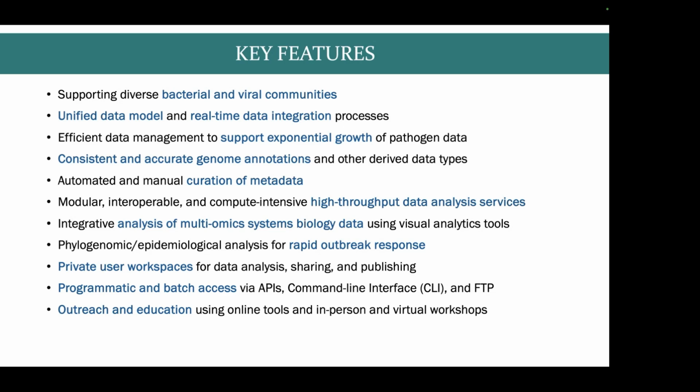So if you're looking at one bacteria or one virus, you should see the same format across the website. That model is continuous and should be easy to understand once you figure it out for whatever virus or bacteria you're interested in. We have efficient data management to support exponential growth of pathogen data.